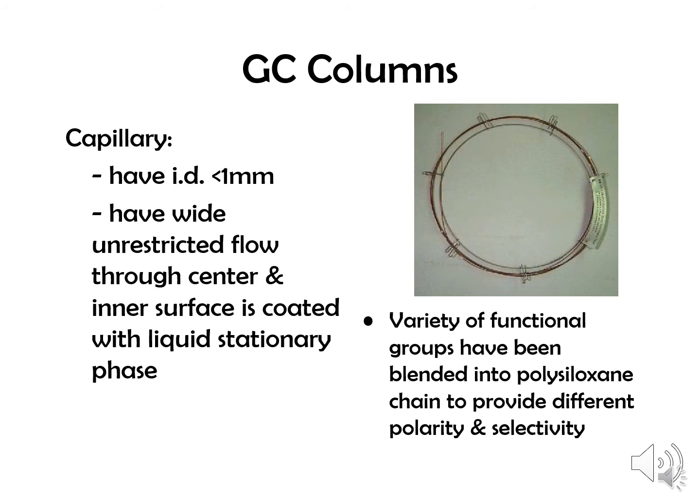And there are different kinds of stationary phases you can look at. There are different thicknesses of stationary phases. There's an unbelievable amount of GC columns out there. Fortunately, with capillary columns, most of these columns are going to be very, very efficient. So you may not need to worry about which kind of column you select unless you've got a very specific analysis that you're doing. And there are also packed columns, which you can find a lot of information about out there.